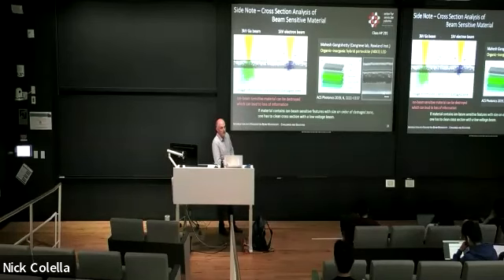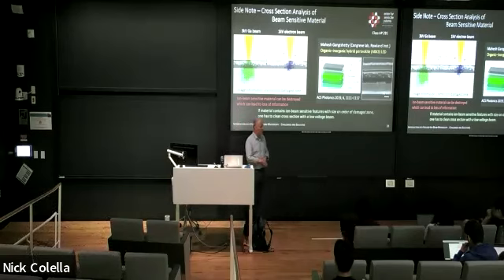the electron signal stems from the defect zone. With that, we can certainly change the morphology. So we are imaging the defective region underneath the surface. And so we have to be very careful. Again, think about, is our material prone to potential damage? So this is, again, soft materials with very small feature sizes.